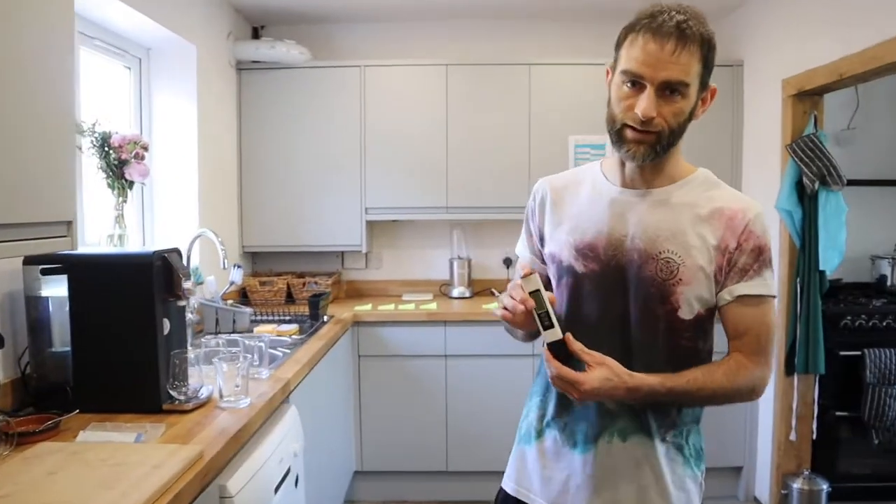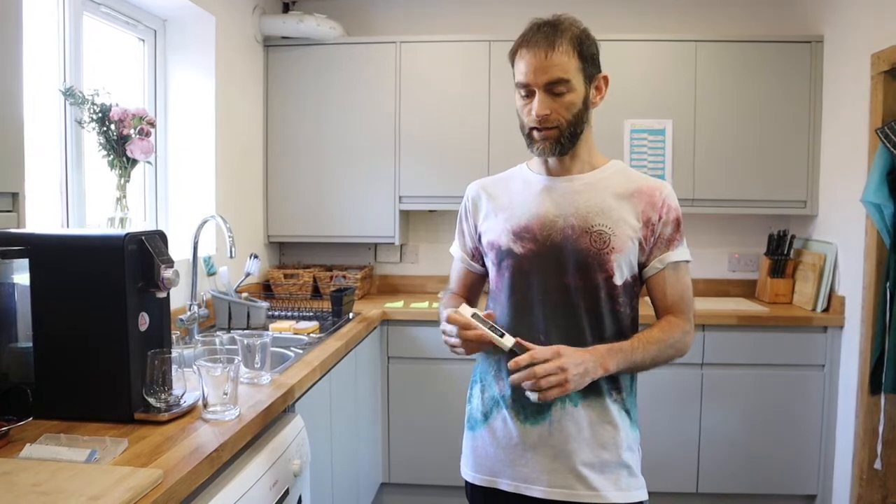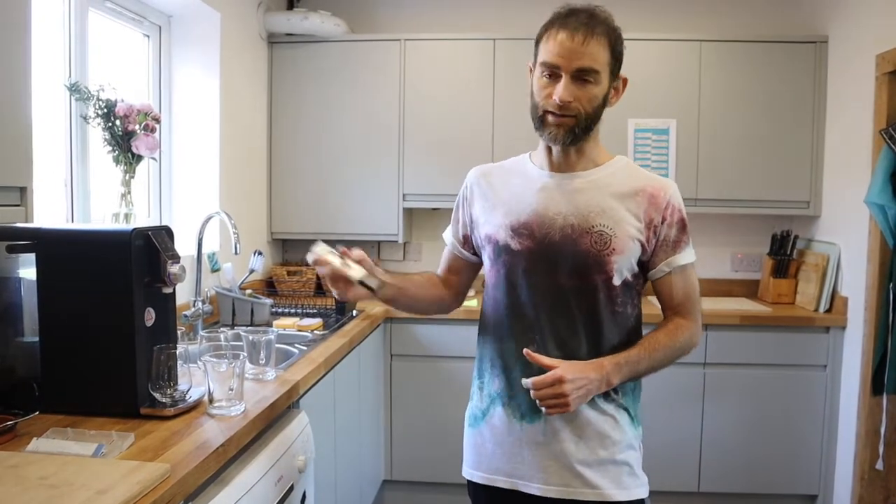I'll be testing with this TDS device — Total Dissolved Solids. It's a very crude measurement, to be honest. It's not going to tell me if it's lead, sodium, mercury, or stuff like that. It's just a rough guide of how many total dissolved solids are in each water — the lower the number the better. It can't distinguish between calcium, lead, or arsenic, so it is crude, but it gives you a rough idea of your water quality at home.